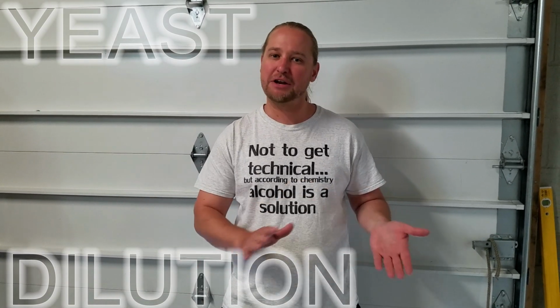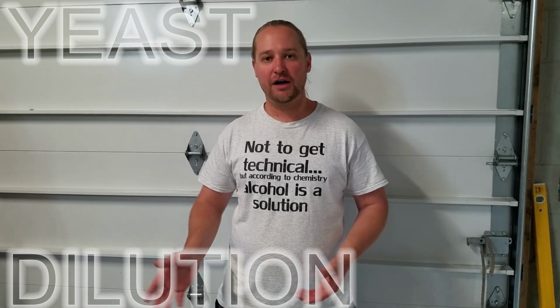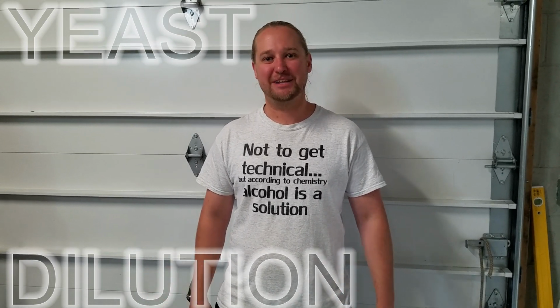Today we're going to do a video on getting our yeast dilutions for our yeast counting. There seem to be a lot of nice videos out there about loading your hemocytometer and counting with your hemocytometer, but I can't find any videos on how to do yeast dilution by weight. So that's what I'm going to show you guys today. Hopefully you enjoy it. Let's get into it.